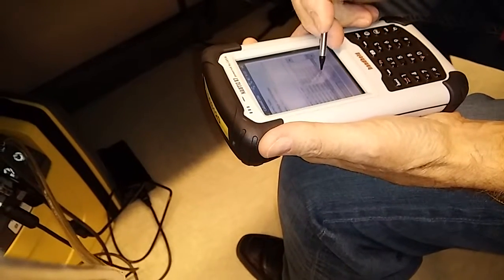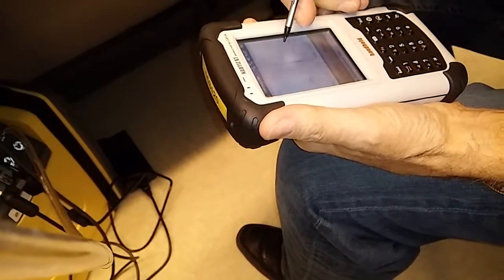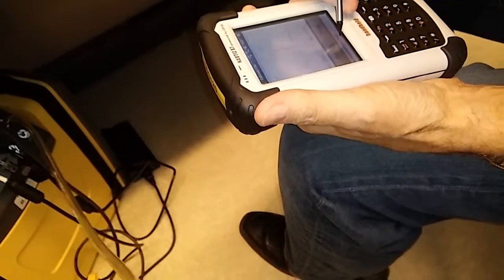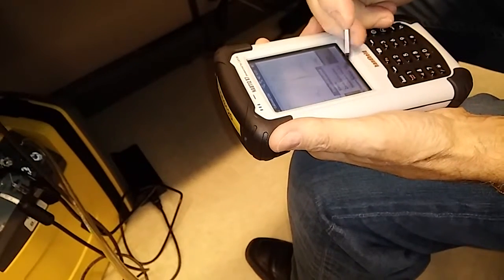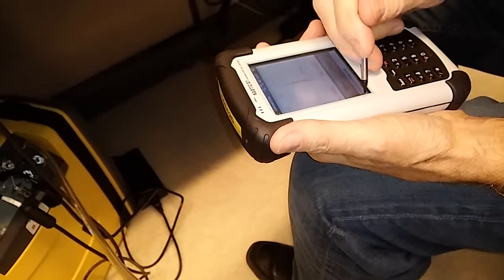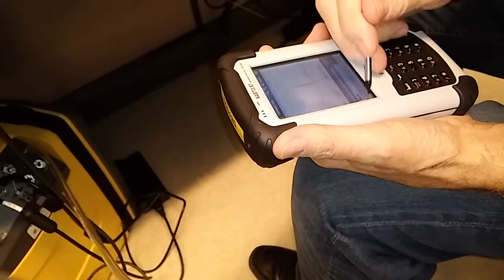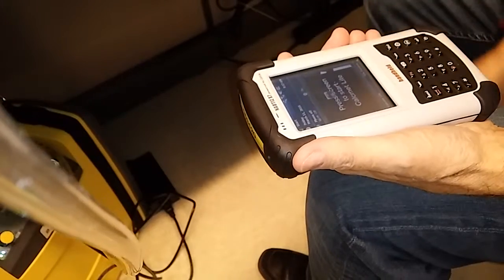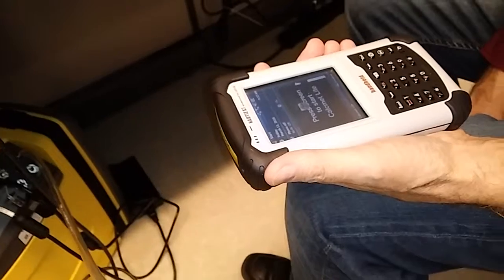956. No, opening. Well, that's the spectrum, but I don't want the spectrum. I actually want the measurements, but it's not showing me the measurements. Analysis enabled, okay. File. Switch to simple view? No, doesn't give me that either. Okay, start the CalMet again. It was just showing the spectrum and not showing the individual readings.